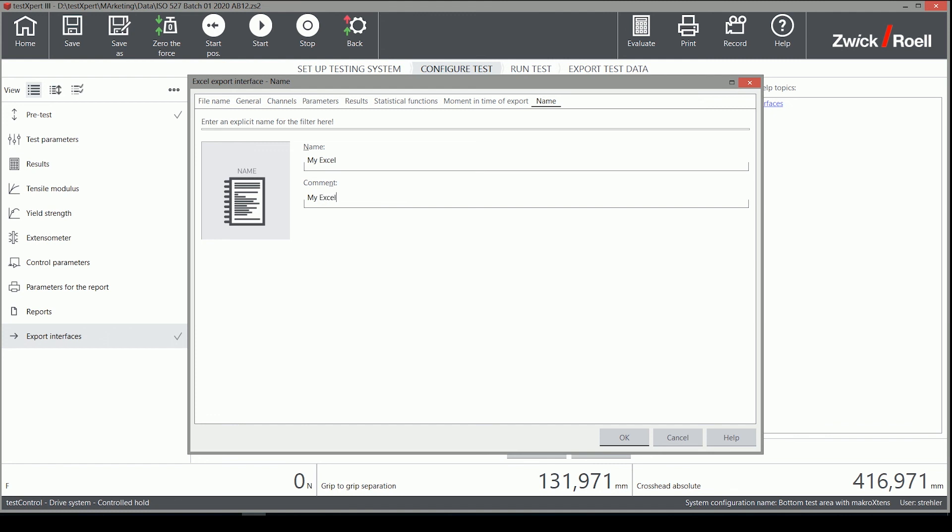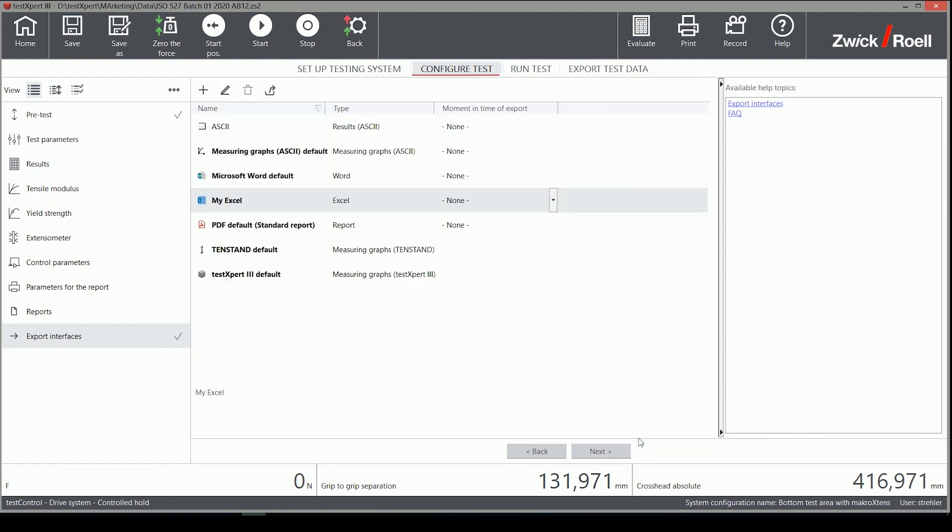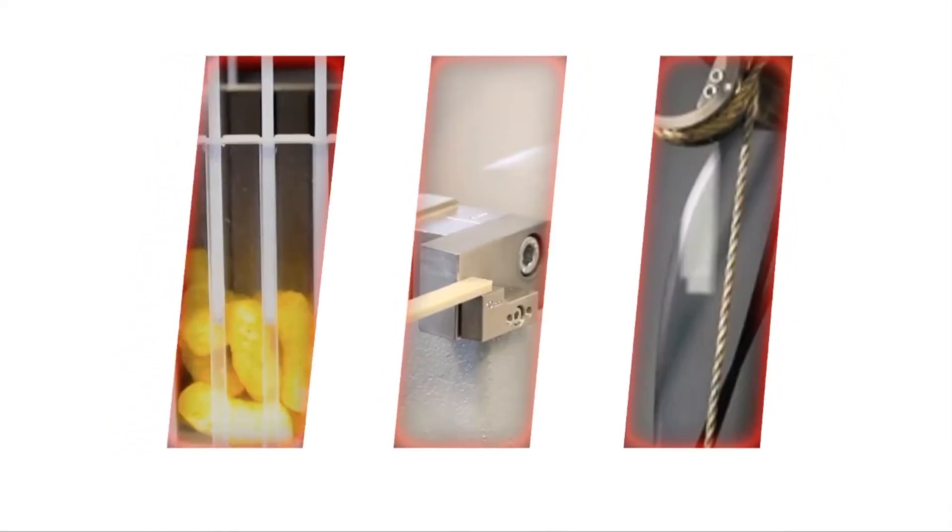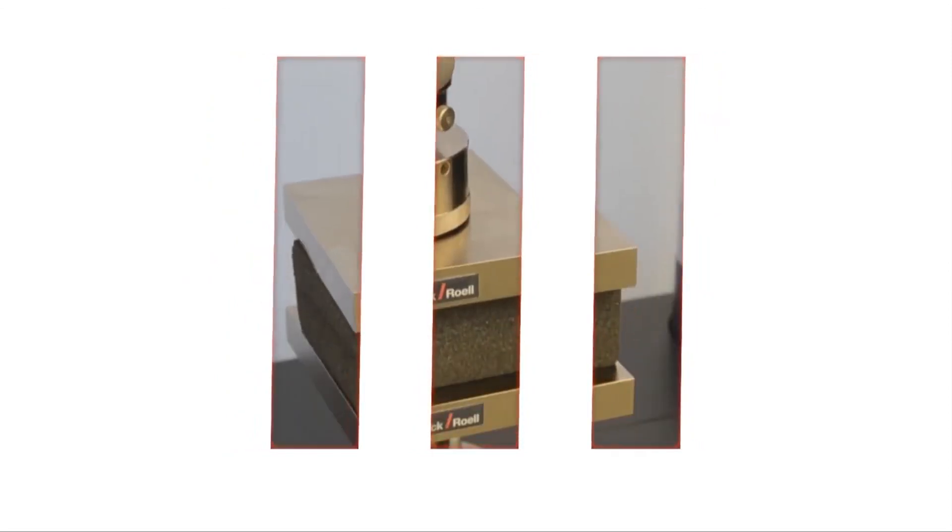As you have seen in this short video, there are many settings for customizing your Excel export. Please feel free and try different settings. I am confident you will be able to set your filters to suit your particular needs. We are happy to report most of our users are already happy with the default settings from Zwick Roell.